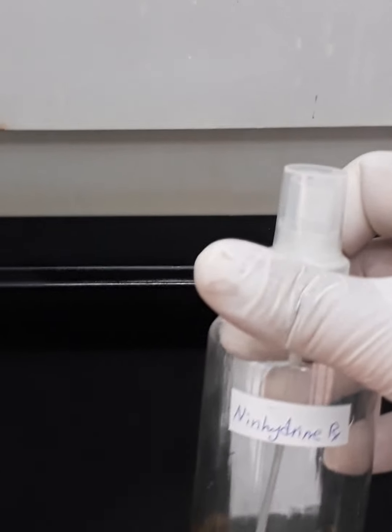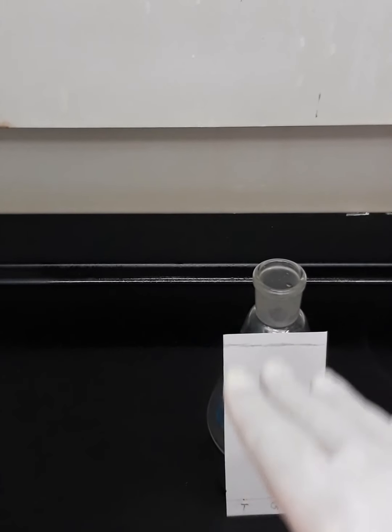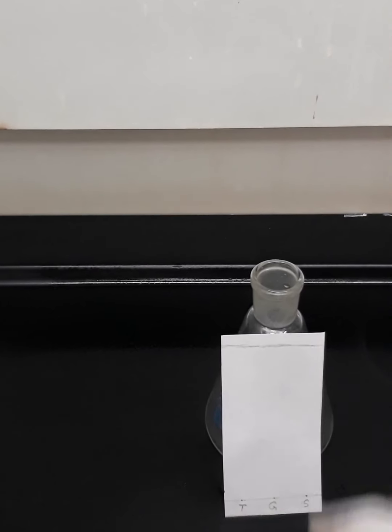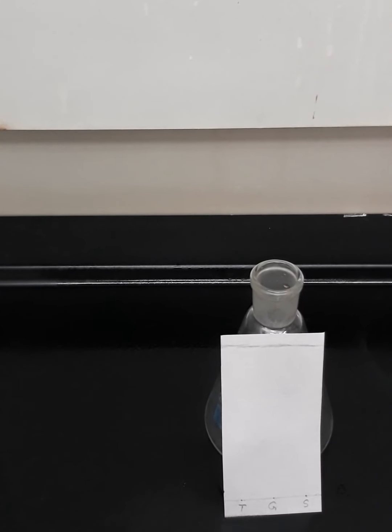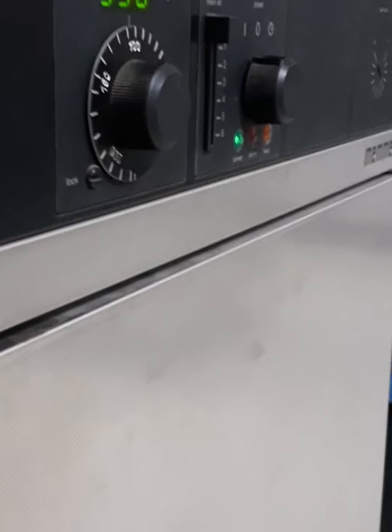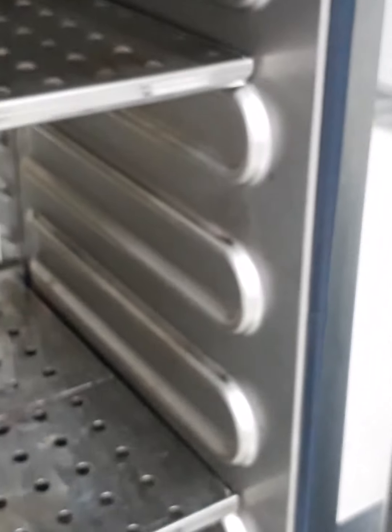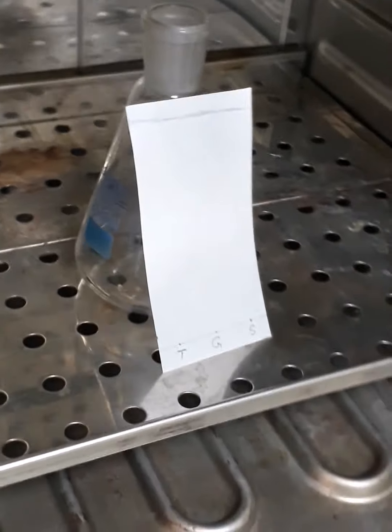The function of the ninhydrin is that it will react with whatever amino acid or protein sample is within this space of the chromatogram, and then it will colorize it blue. But for sure we have a later step, which is heating the chromatographic paper using the oven. So stay with me. So now we are going to use the oven, and the temperature is set at 110 degrees Celsius. So here we are going to place the support and the chromatographic paper, and we will keep it inside for 5 minutes.